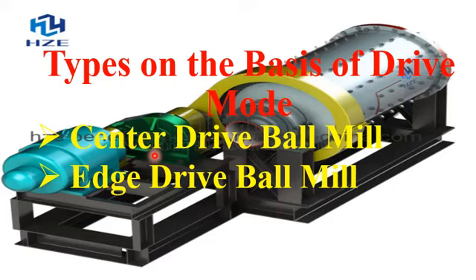So if the power device is placed at the center of the ball mill apparatus, it is known as a central drive ball mill, whereas if the power source is placed at the edges, then such a ball mill apparatus is known as an edge drive ball mill apparatus.